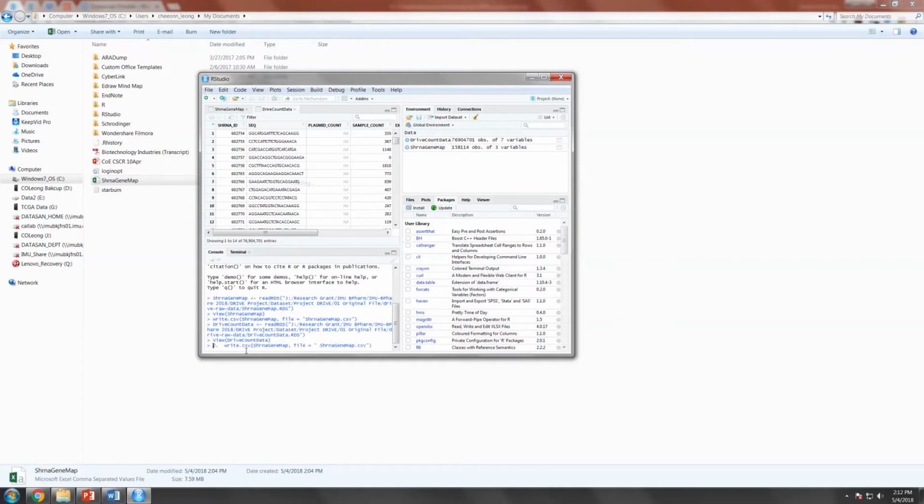So basically you put in the command again. Sorry, you can just copy from here. The command is write CSV, and then the file is drive count data. You copy here and paste the source file here. Then the output file would be the same but in .csv format.